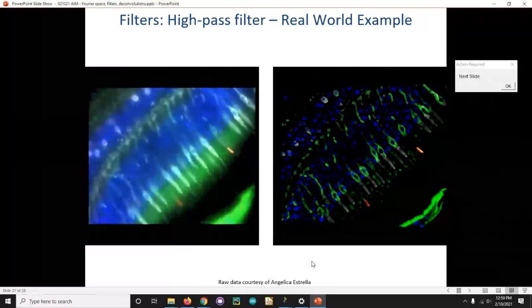I should add one caveat, which is that this trick works because the remaining information in the image is purely high frequency information. It's neurons, it's fine detail, sharp edges, membrane bound stuff. If your image is a smooth or large solid object, then this trick will not work, right? Because if it's a smooth, round, solid object, then there's low frequency information filling the center of the object. So it just takes a bit of knowing about your image to know whether simply removing a blur will work, or, for those solid objects, whether you have to do a real deconvolution.